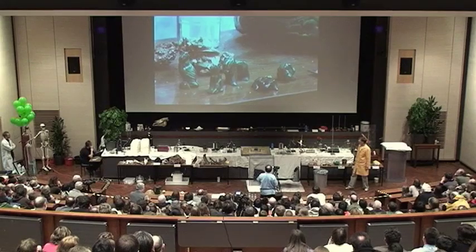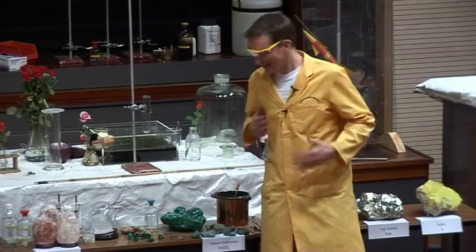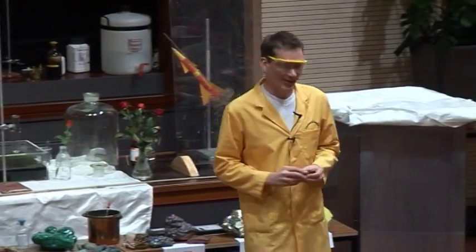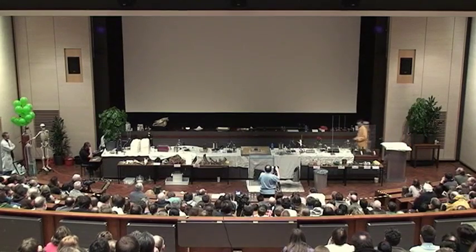So we're going to do a little experiment on one of these to see if we can get the copper out of the malachite here. Let's take the dog's head, mainly because my mum quite likes the other ones and she wanted one of those. So let's take Chip here.